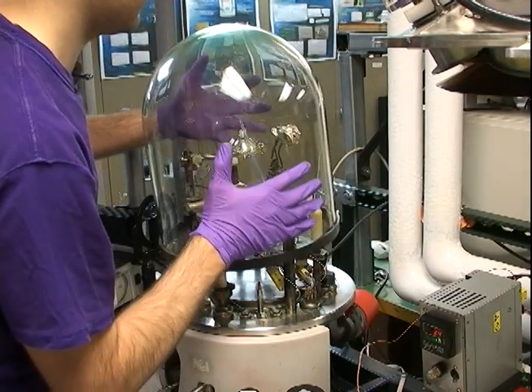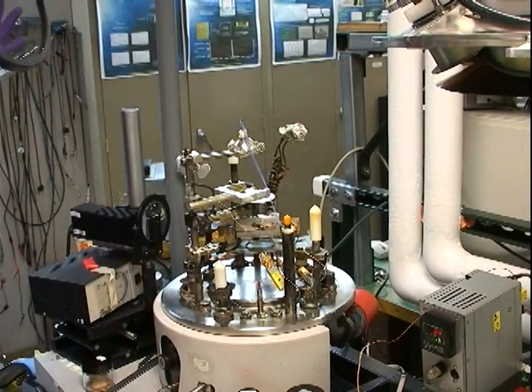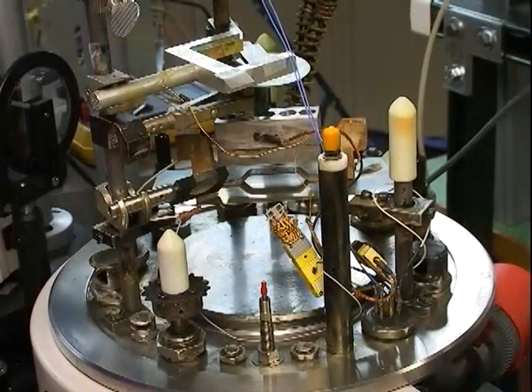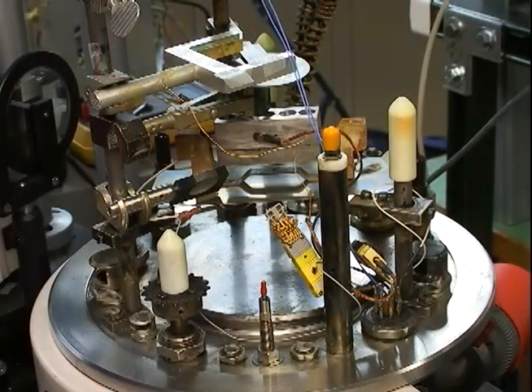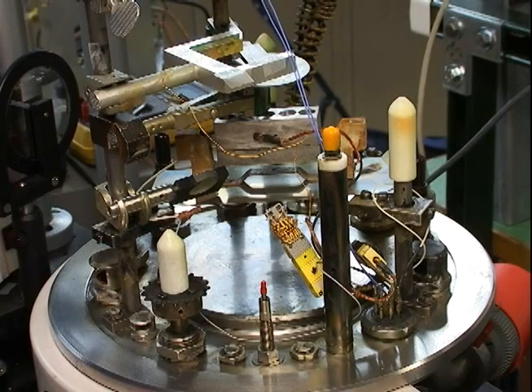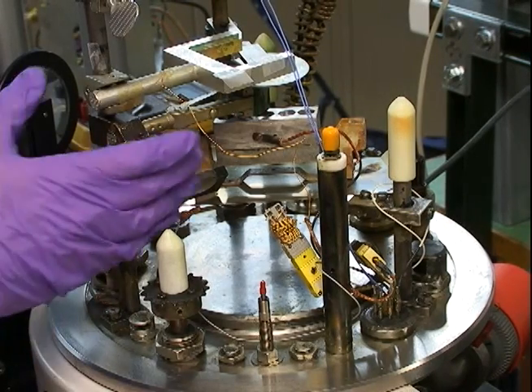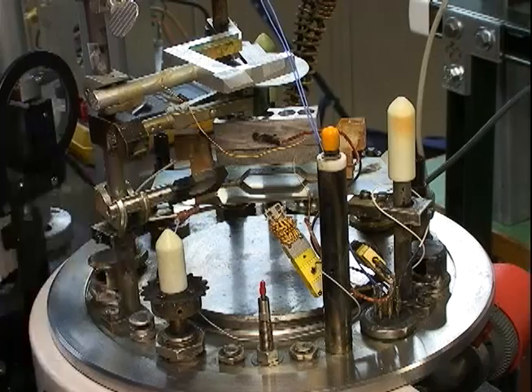Now I'm going to take off the bell jar and show the hardware underneath. While most vapor deposition instruments have a lot of variety, there are a few things they share in common. To begin with, there's always some sort of sample holder. In this case, it's an aluminum block.